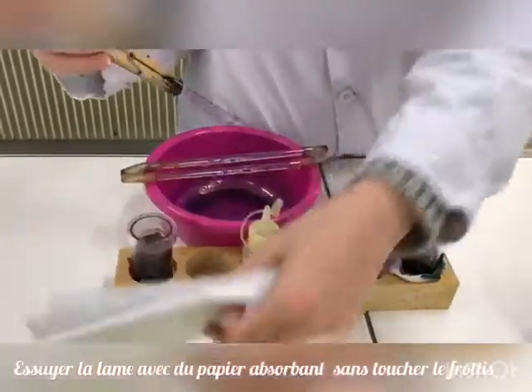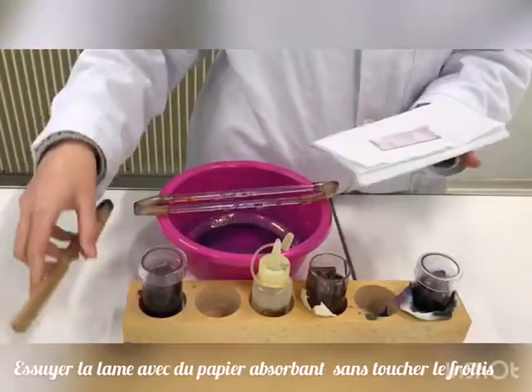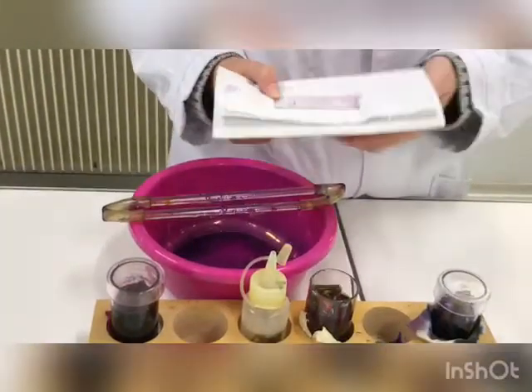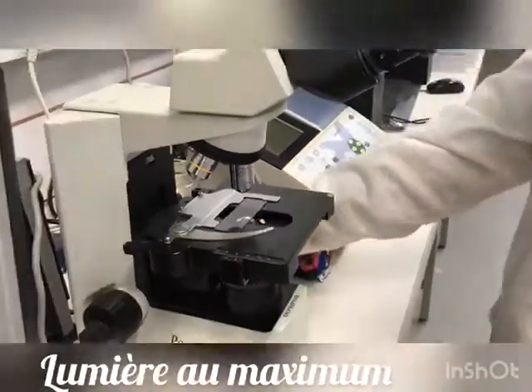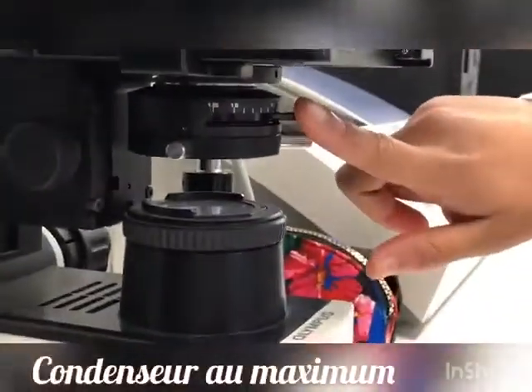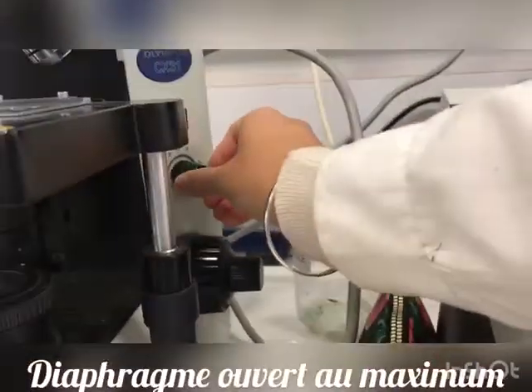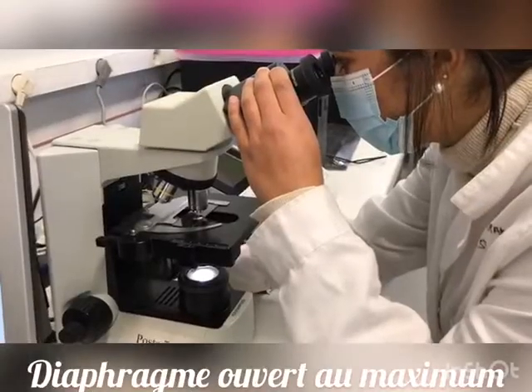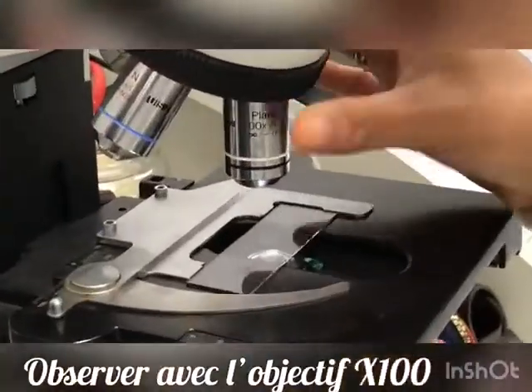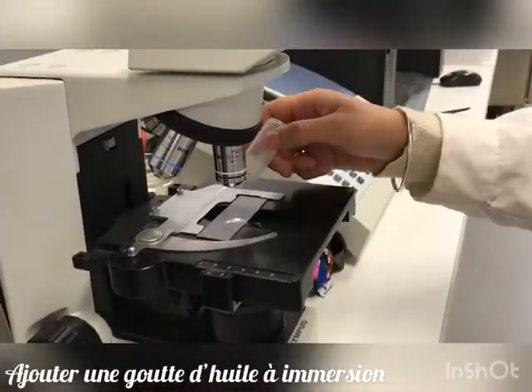Dry the glass slide with absorbent paper, taking care not to touch the bacterial smear. To observe under the microscope, use full light — the diaphragm is completely open and the condenser must be in position. Find a good microscope field and observe under the 100x lens with a drop of immersion oil.